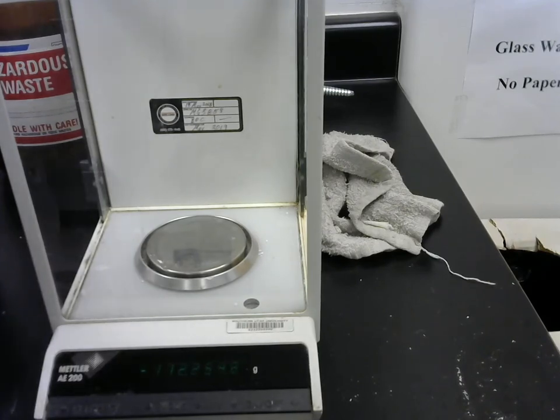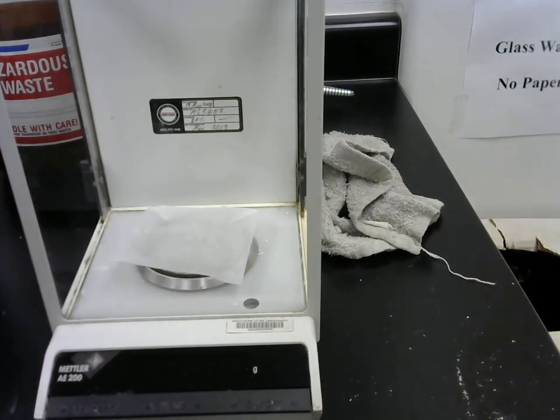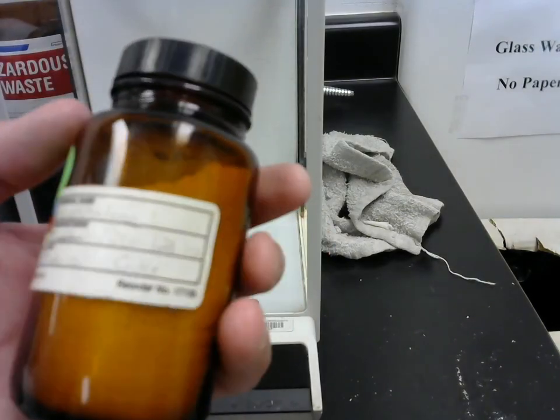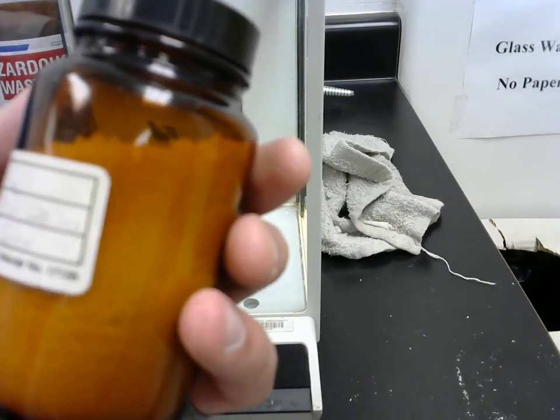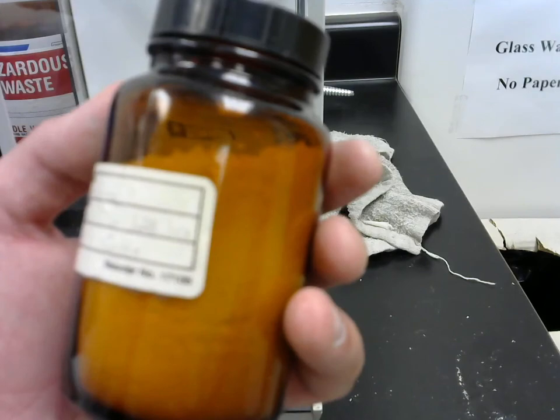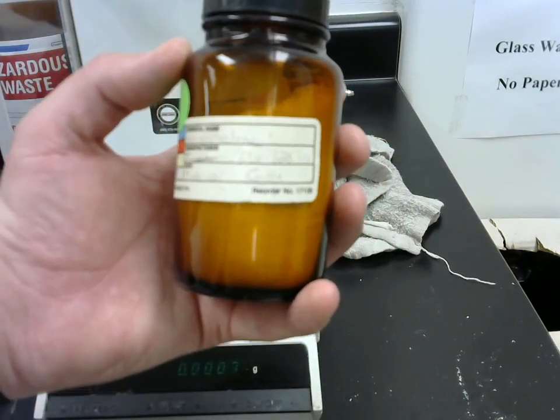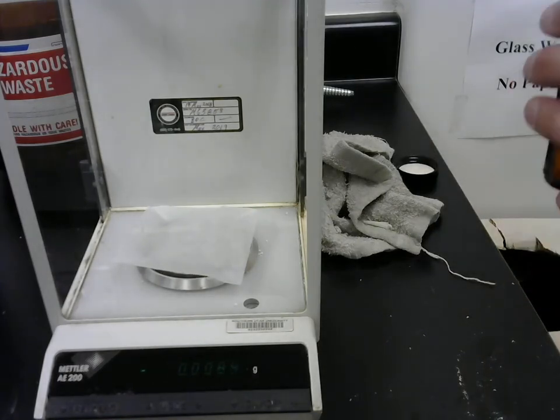Now we're going to weigh out an amount of solute that we're going to add. So like I said, this solute is naphthalene. Naphthalene has a formula weight of 128.16 grams per mole. Oops, sorry. I don't know if you can read that or not. It looks kind of fuzzy. But naphthalene, you can look it up and confirm that. And we're looking to get between 0.2 and 0.3 grams of this.